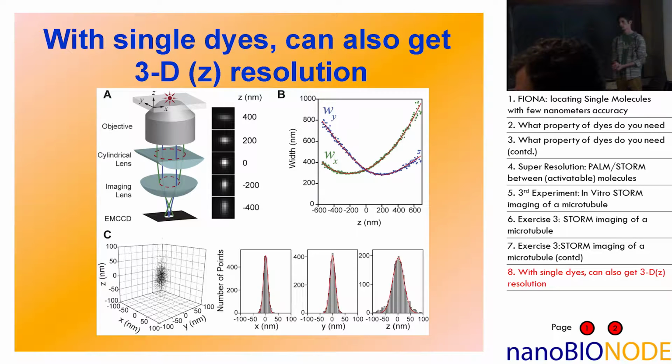What I don't get is, if you're taking one cross section one way and another cross section the other way, isn't the peak height at the same place? Why would they have different heights? Yeah, that's one thing I'm uncertain about. My logic was that it's the same number of counts in both cases.